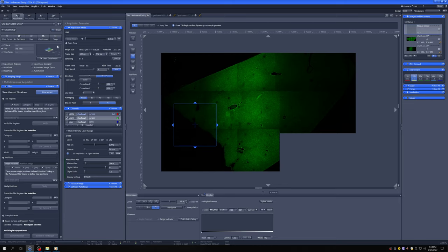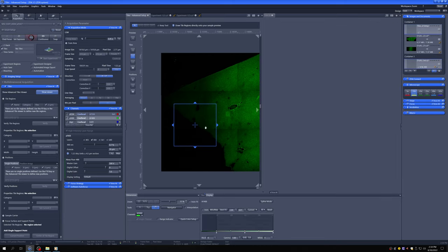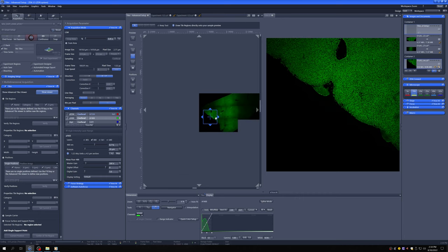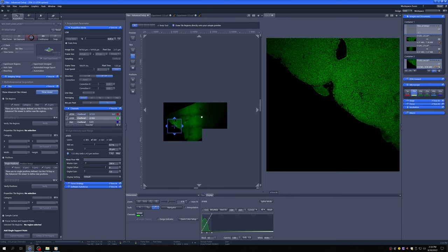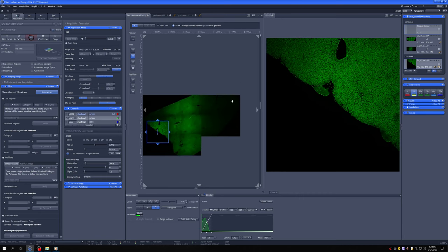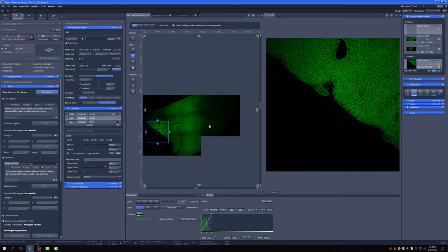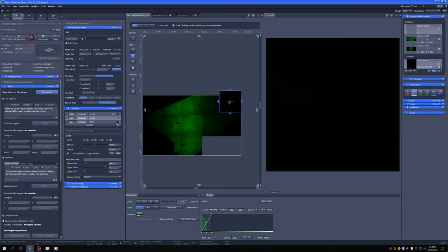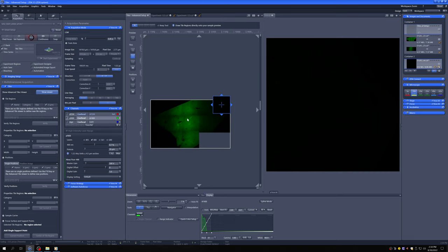So let me illustrate this with live. You can see that when I'm in focus there on that side, if I go to the other side, I am out of focus. So is there any way that we can deal with this? And the answer is yes, there is. This system has a way of compensating for that, which I'm going to show you now.